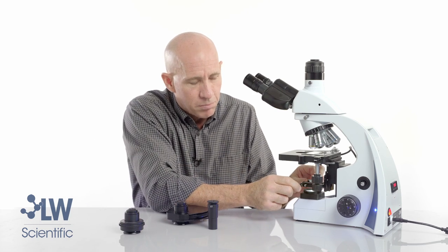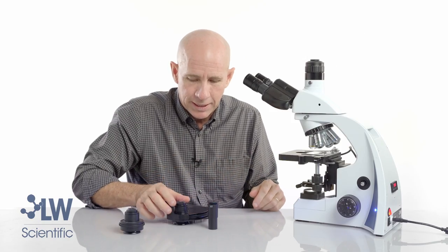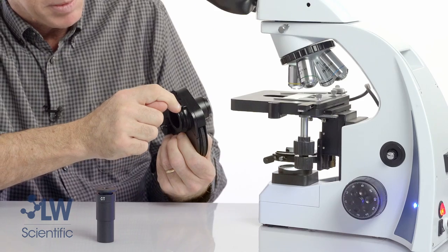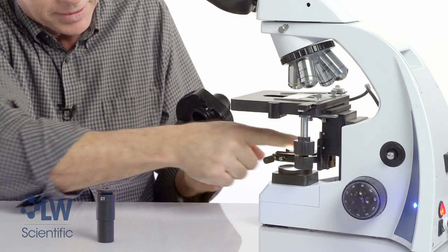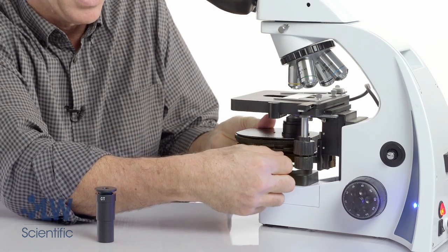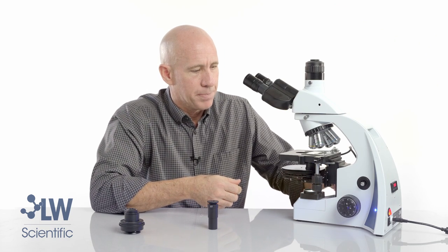Do not move the alignment knobs here — these are for gross alignment of the condenser, we'll talk about that later. As you're putting in your phase turret condenser there is a pin and there is a slot. Make sure that it hits the slot, tighten it up securely, and then move it all the way up.